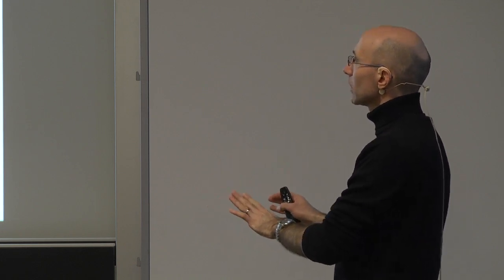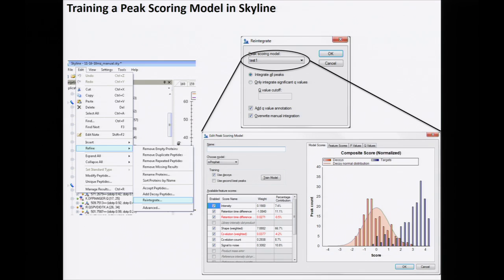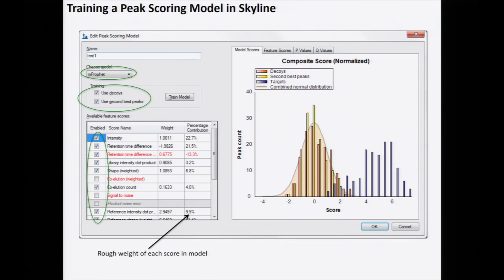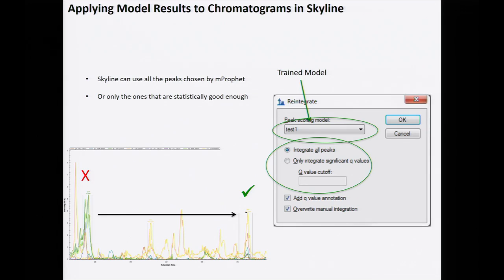Skyline now allows you to generate decoys directly within the program. You can indicate what type of decoys to generate, specify the model type, and it will produce the corresponding plots. You can look at distributions of targets and decoys, select which scores have the strongest power, deselect uninformative scores, examine histograms of individual and composite scores, and view p-value and q-value plots. You can then report only peaks that have a certain q-value threshold, quantifying only peaks with confident identification.